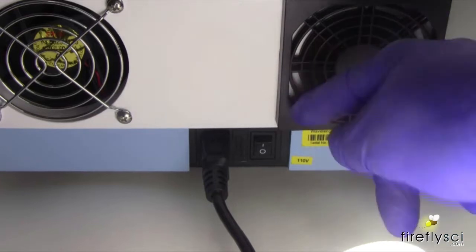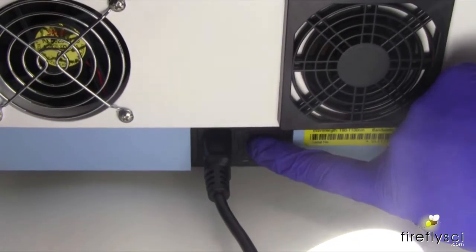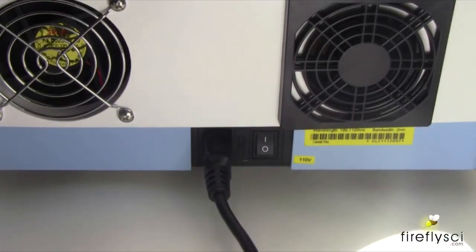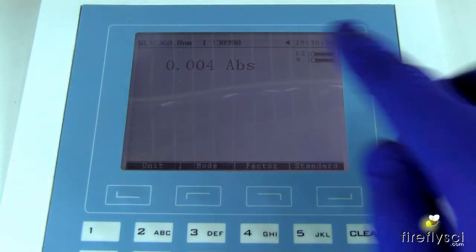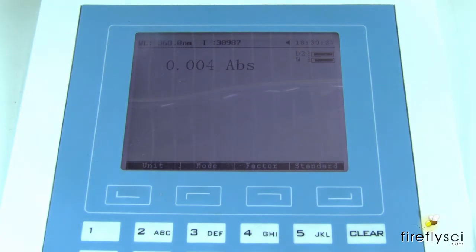As usual, the first thing we're going to do is put on a spectrophotometer and let it warm up for 45 minutes. So we're going to perform this stray light test at 360 nanometers and I already have that dialed into the machine right here and now I'm just going to go ahead and zero the machine with nothing in the cuvette holder.